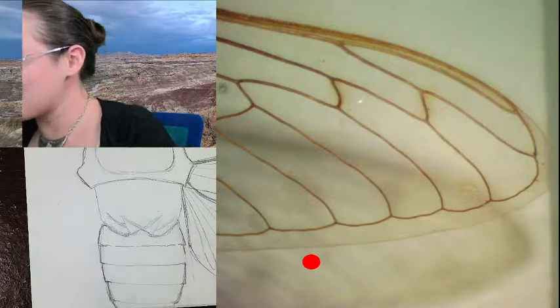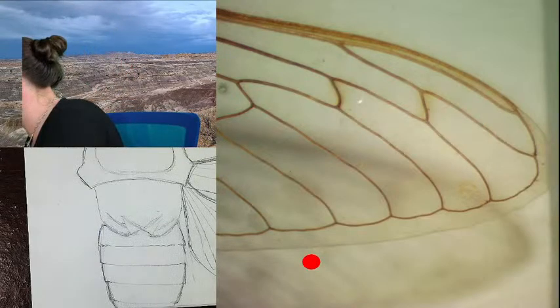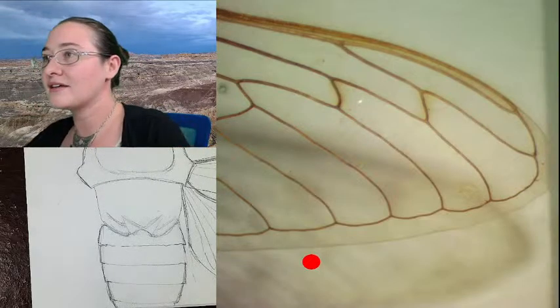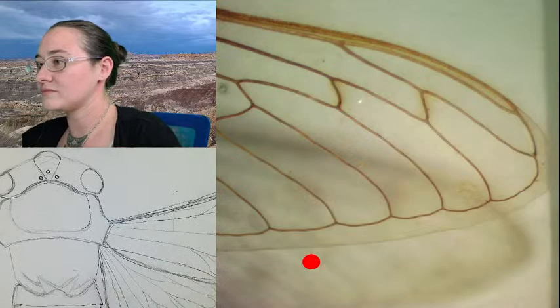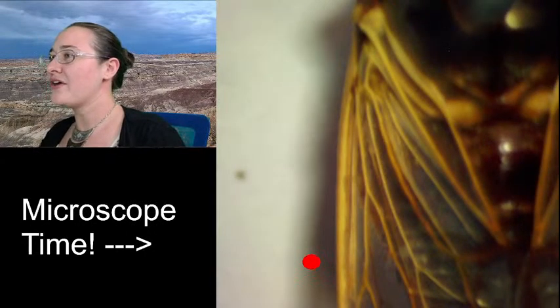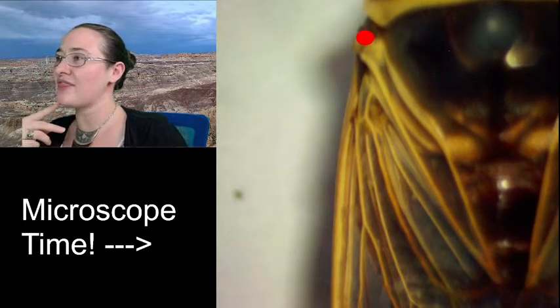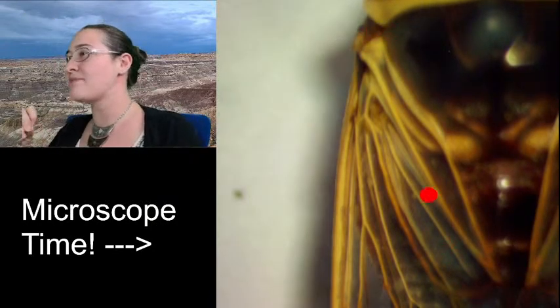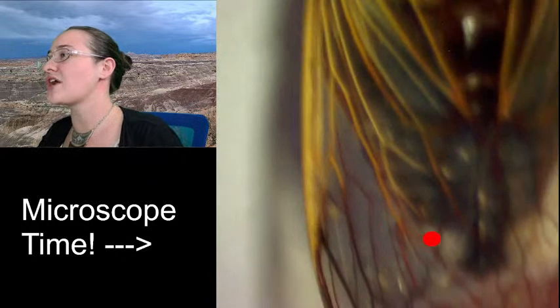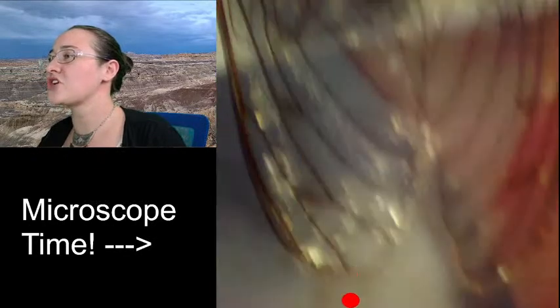Alrighty. So what I can do is give us a cicada under the microscope that will show us what it looks like when the wings are closed over the body. When the wings are closed over the body, the front of the wing is on the edge, and then, because it folds down, the bottom of the wing is up here. And it comes all the way up to the center of the body. And generally, they meet in the center and run down.